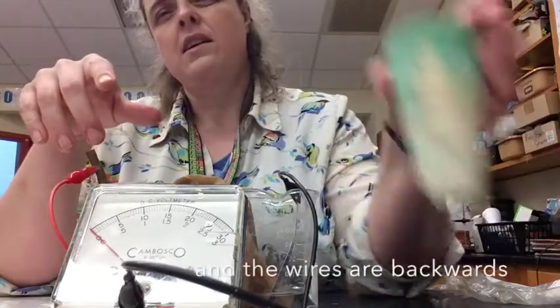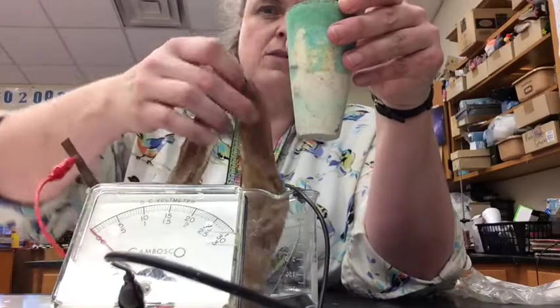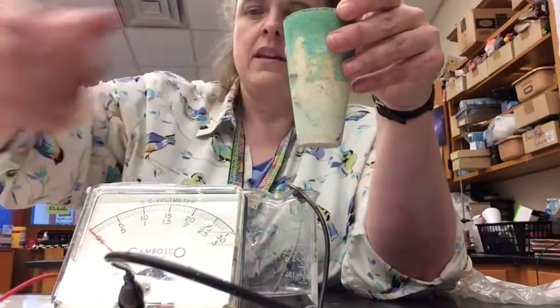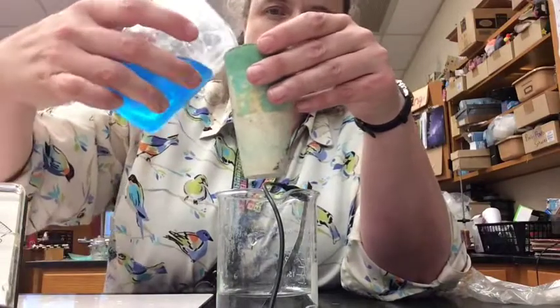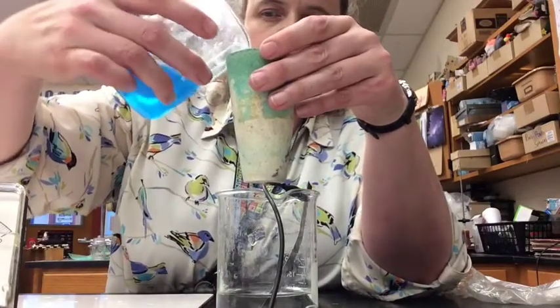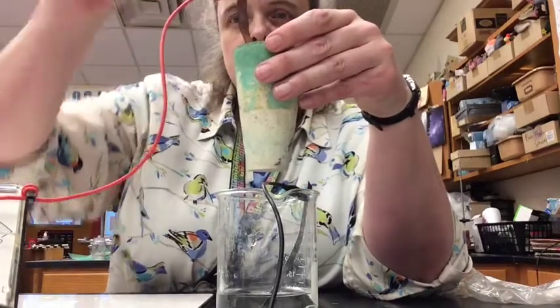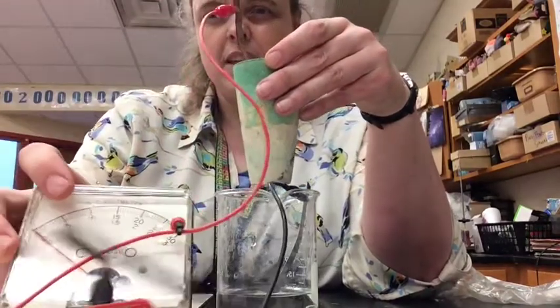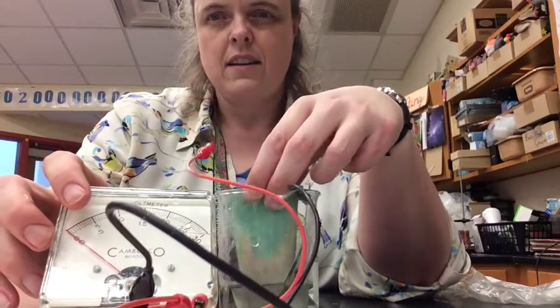So instead, we're going to use this type of a porous cup. So instead of using this salt bridge, let me get the meter out of the way. We're going to pour our solution into our porous cup. And into that, I'm going to put the copper. Now, hopefully, when I set this into here, look at that.